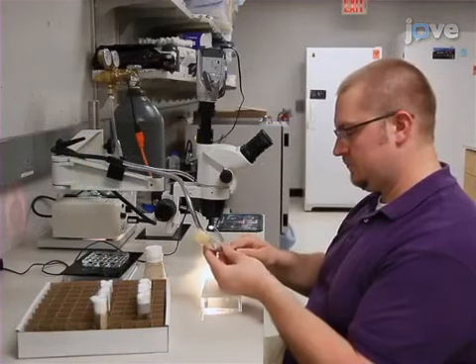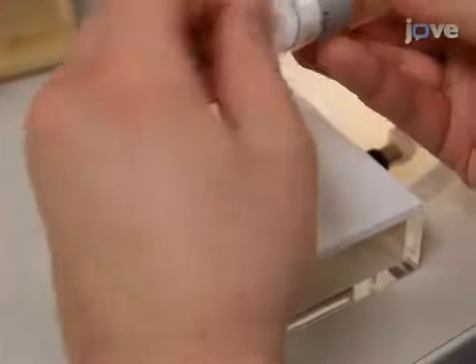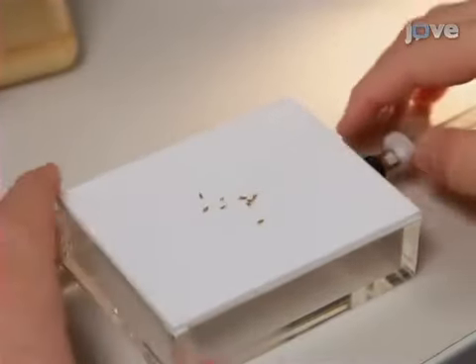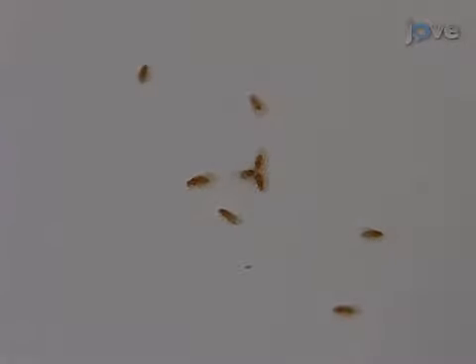Now, begin by anesthetizing flies in their vial with an injection of carbon dioxide, and then transferring 3 to 5 females onto a carbon dioxide-emitting fly pad. Be aware that the flies cannot remain under CO2 any longer than 10 minutes without harm.